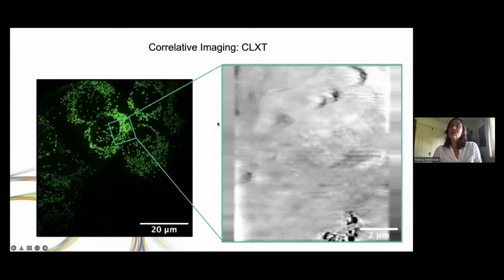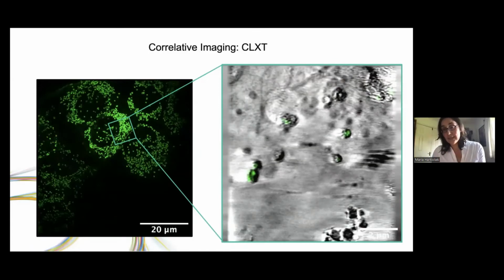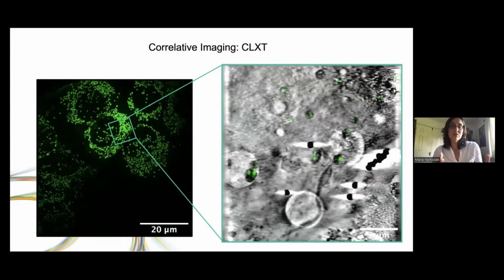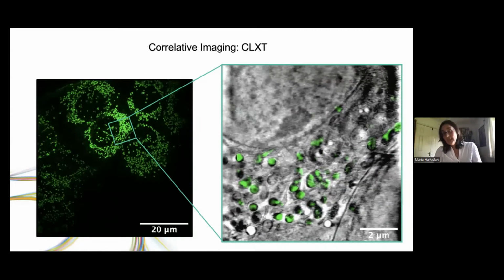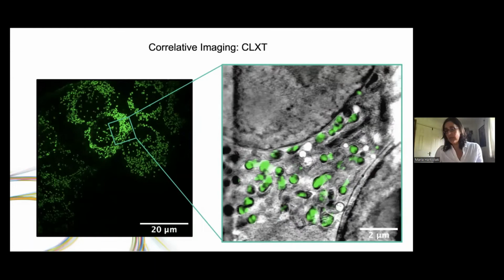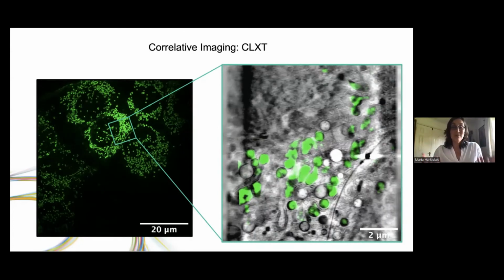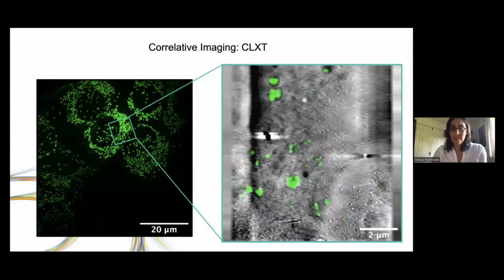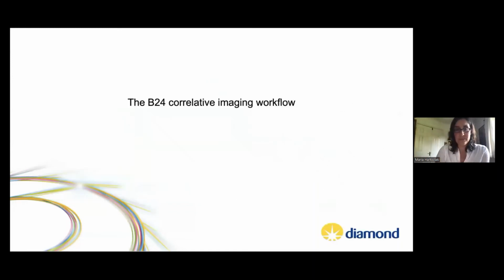And then you can bring the two together. And when you do that, and as I said, this was just an exercise for a student, but I'm just showing you what happens. If we couldn't identify the mitochondria, it would immediately tell us where they are effectively. And we've used that on many occasions to find the proper vesicles or the right structures that contain something we were tracking. Okay. So effectively, bring two things together, make the output so much more powerful than anything else.